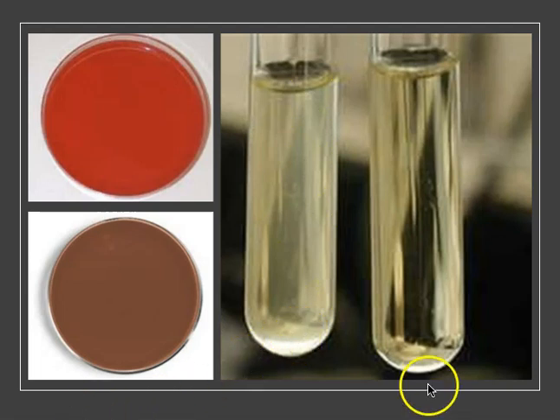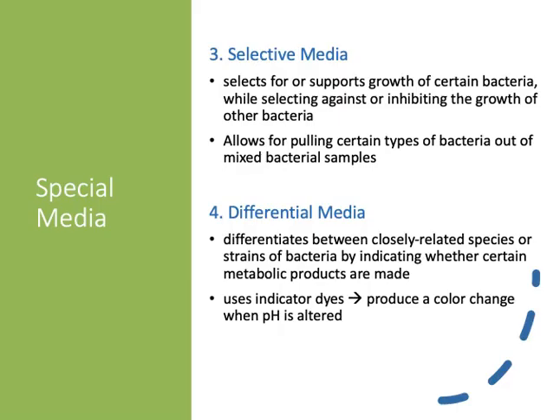Now, the reason we might choose to grow cells in broth instead of on an agar plate is because in a broth culture, we're going to be able to keep the cells separate from one another. We often put these broth tubes onto a shaker device in the laboratory, a device that will gently swirl the broth as the cells incubate and grow. We can then use broth to inoculate other culture containers, including agar plates. So both basal media and enriched media are referred to as growth media.